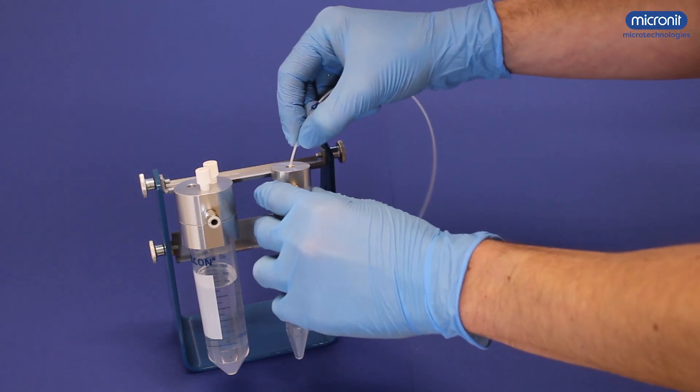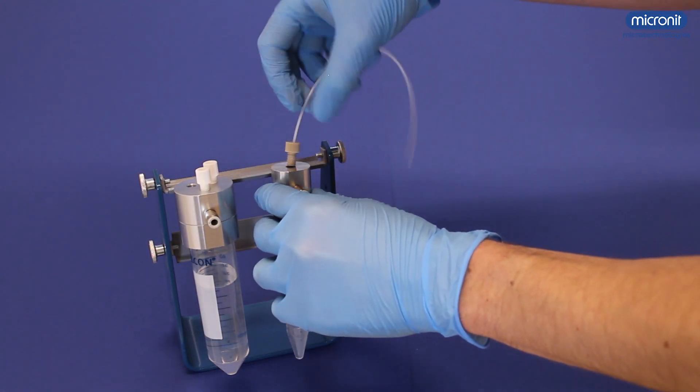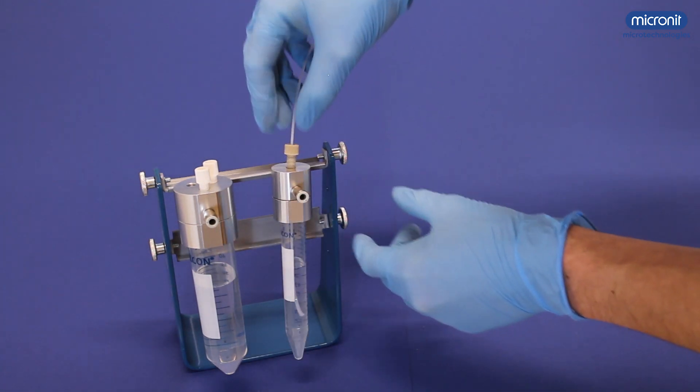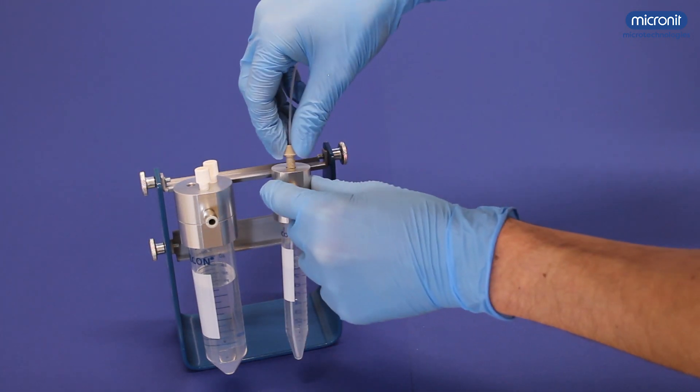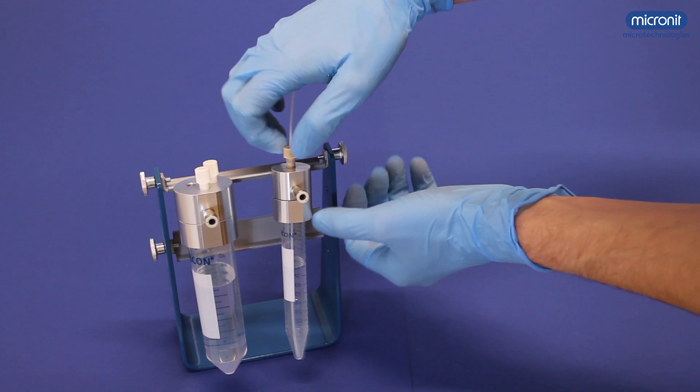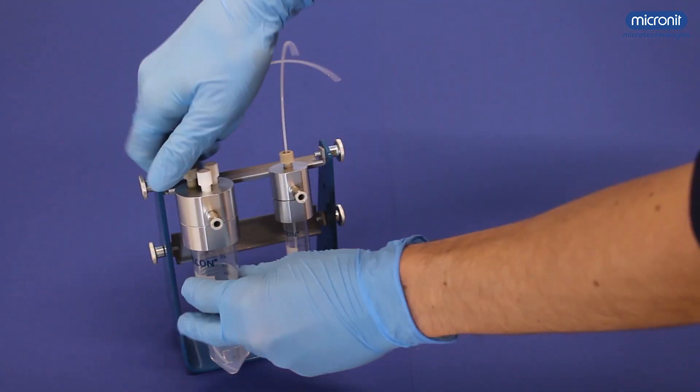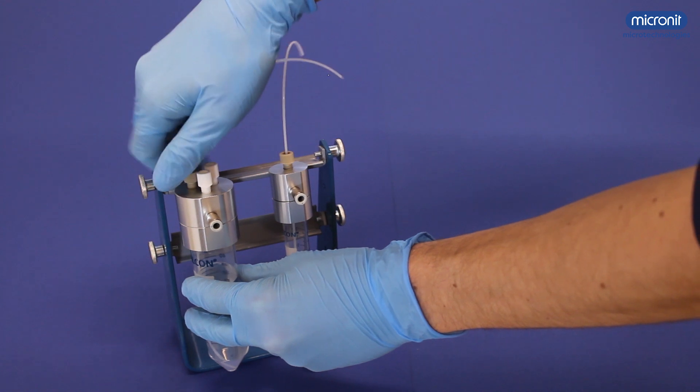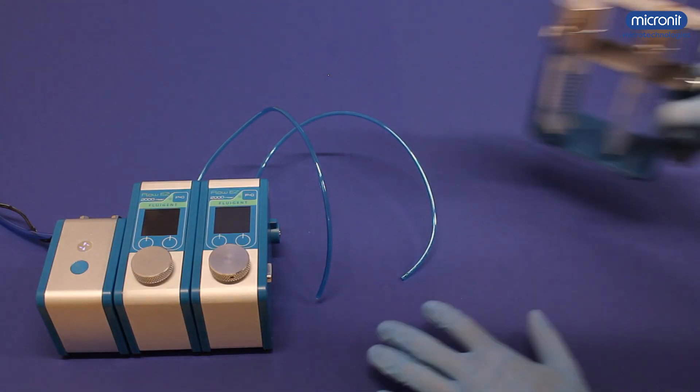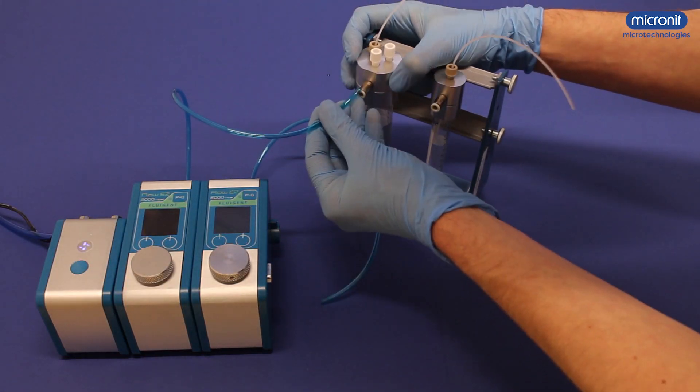Now put your tubing in the fluid reservoir and let the tubing almost touch the bottom. Screw to make an airtight connection. The same can be done with the other reservoir. Connect the pressure controlled pump to your reservoirs.